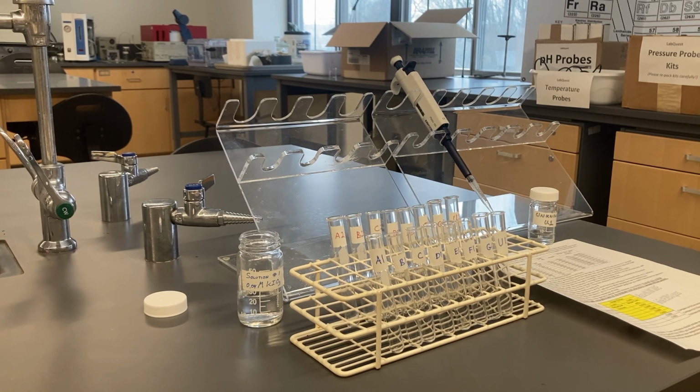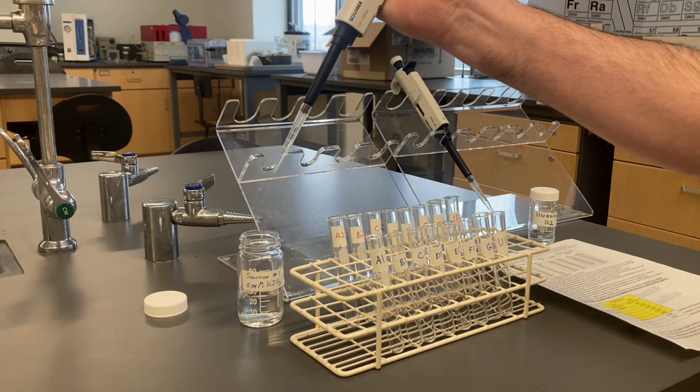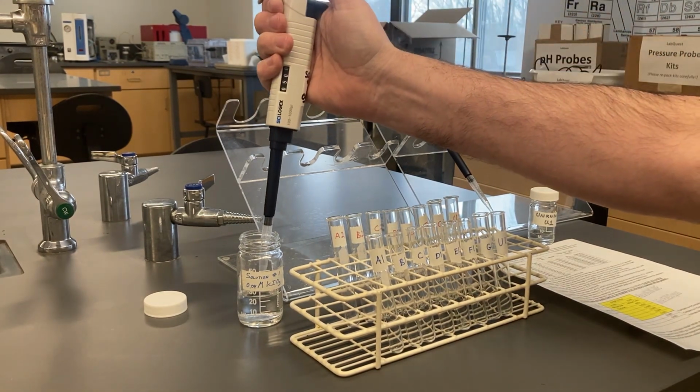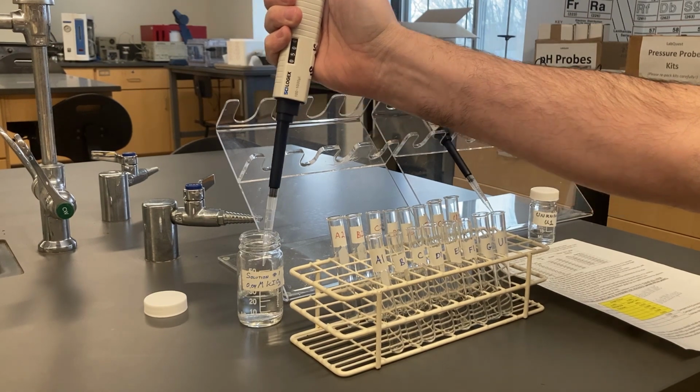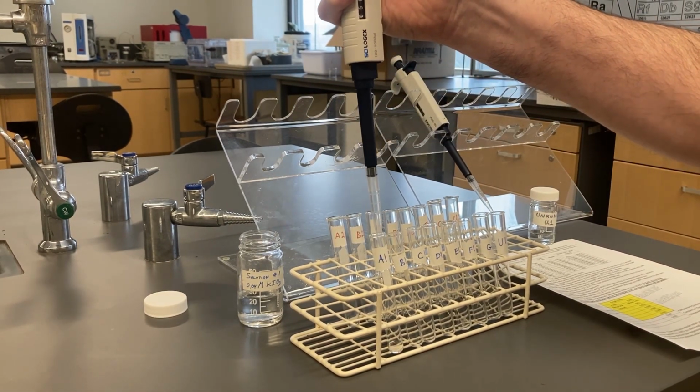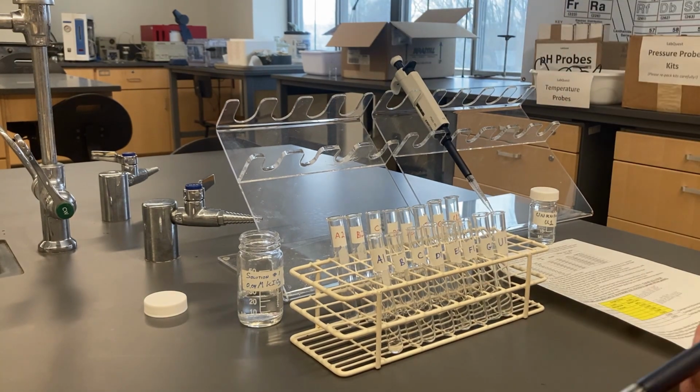All right, I have all my test tubes labeled, and I'm going to be adding solution 1 to all the test tubes in number 1. And according to my chart, I'm going to add 500 microliters to A1. So I've already set my micropipette on 500. And I'll add my 500 to A1.